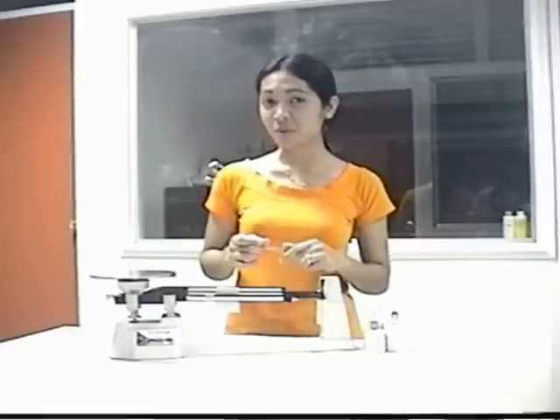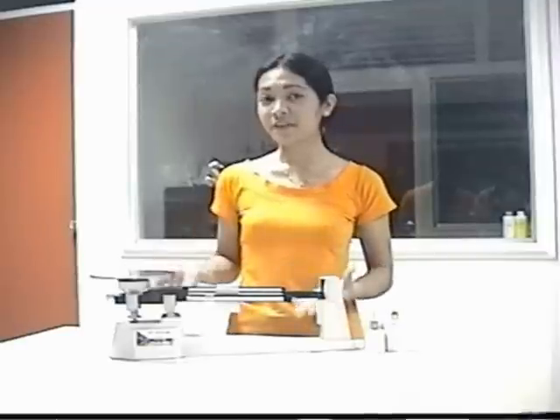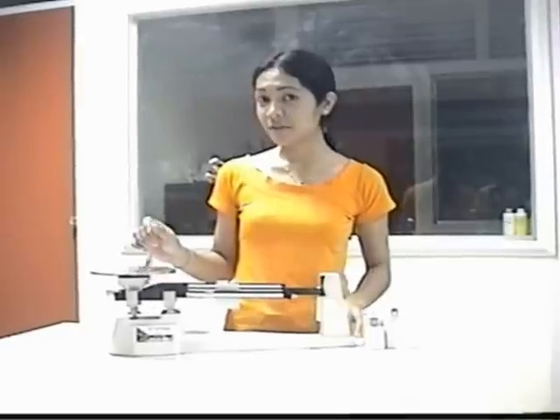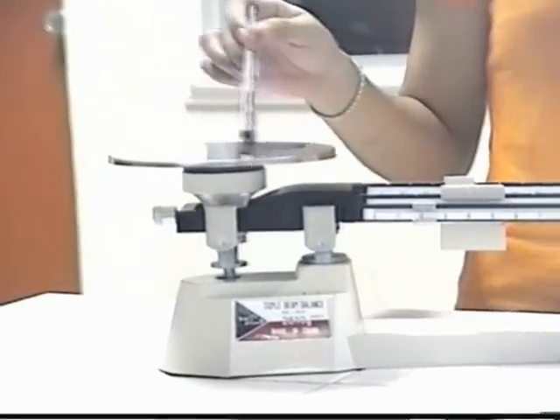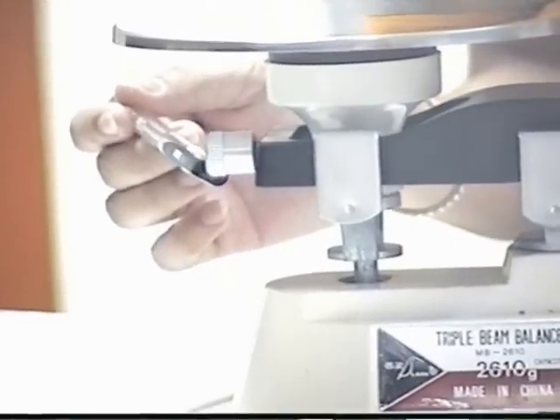We all know the Triple Beam Balance is used to measure a small object. It is also used to weigh an object. But before that, I'm going to present to you the different parts of this Triple Beam Balance. This one is what we call the Metal Platform, and this one here is called the Adjust Knob or the Adjust Screw.